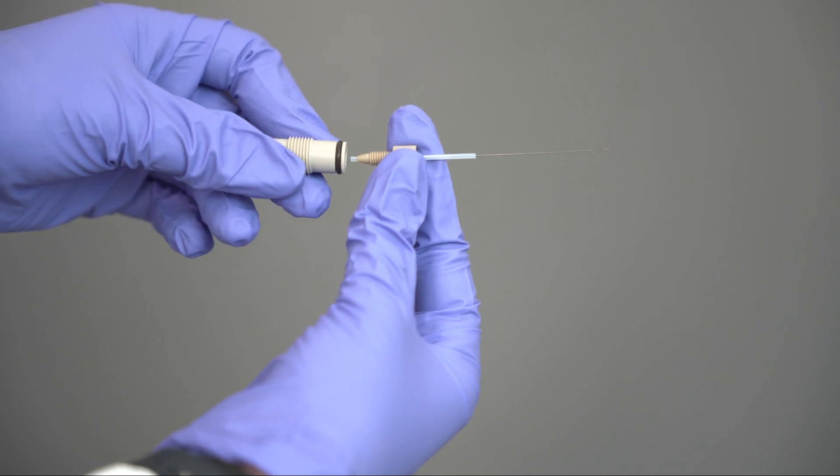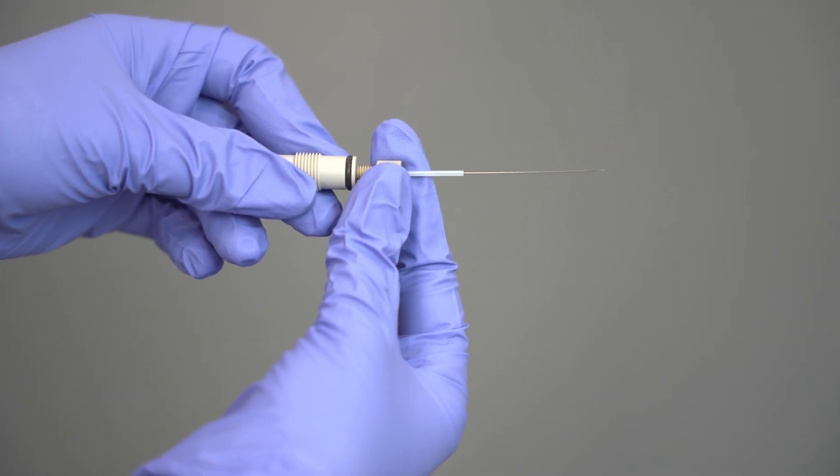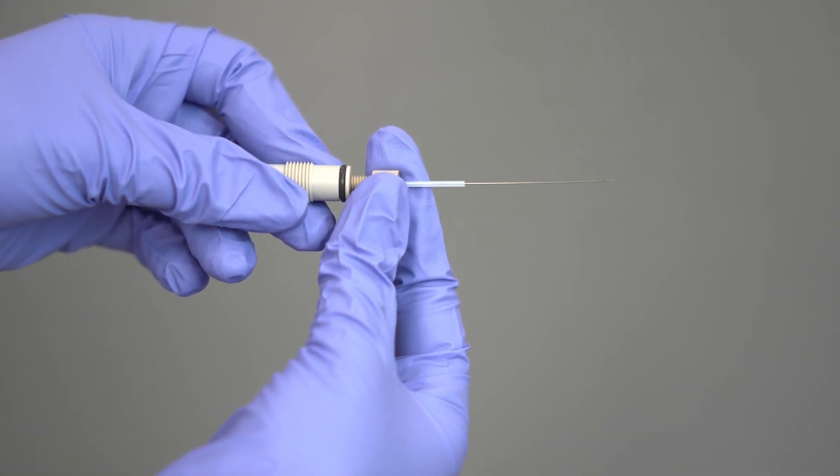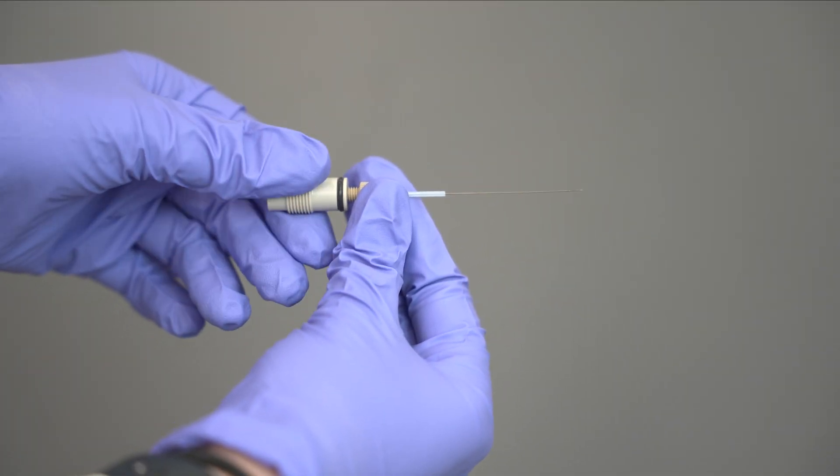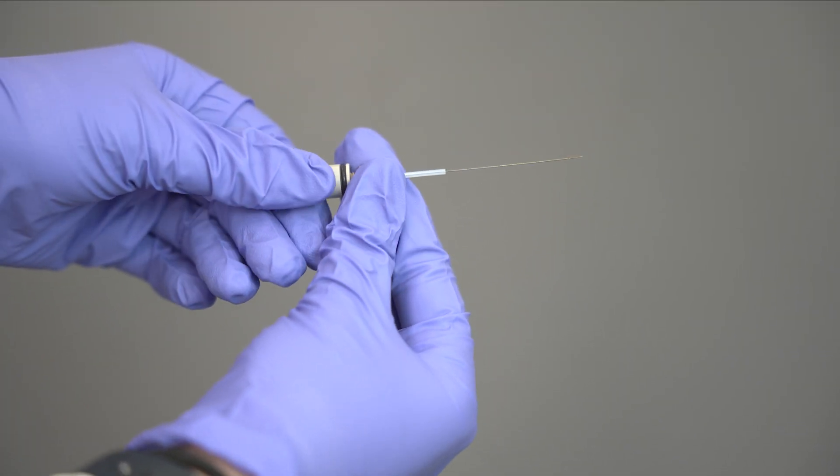Now the new capillary assembly can be mounted into the ESI coupling. This must be done on the side of the ESI coupling with the black O-ring. Now you can screw the capillary assembly into the coupling and finger tighten.